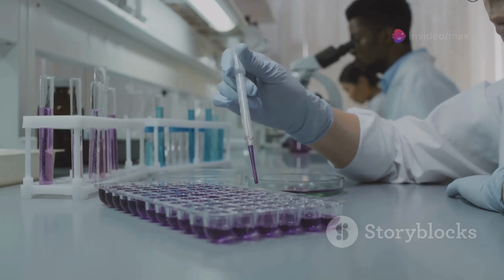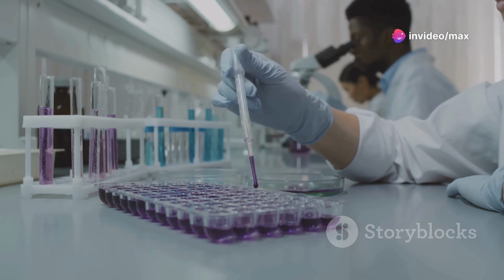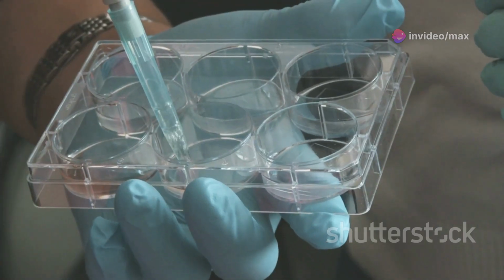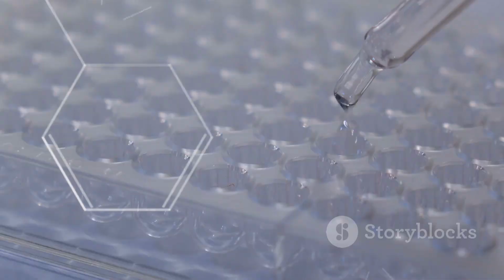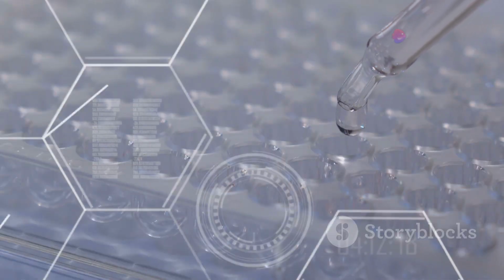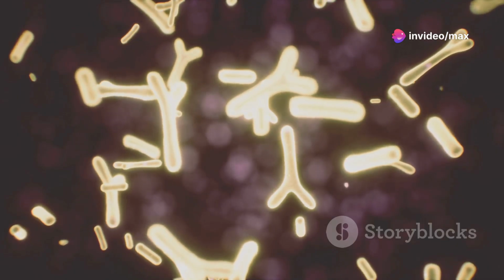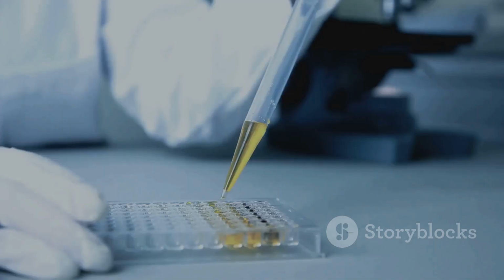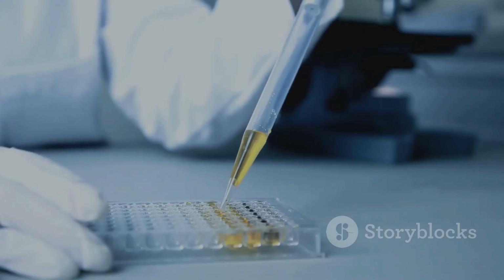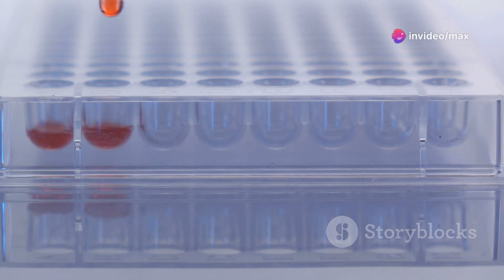Section 5. Sandwich ELISA Procedure. A step-by-step guide. Let's break down the sandwich ELISA procedure into easy-to-follow steps. First, the capture antibody is coated onto the wells of a microplate. This antibody acts like a hook, grabbing onto the target antigen. Next, the remaining surface of the wells is blocked with a blocking buffer. This prevents non-specific binding, ensuring accurate results.